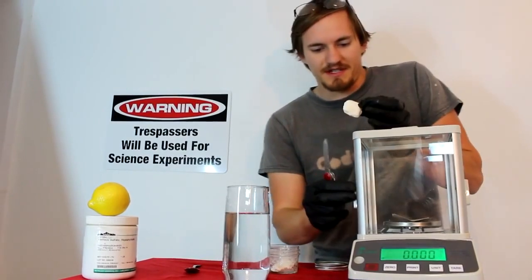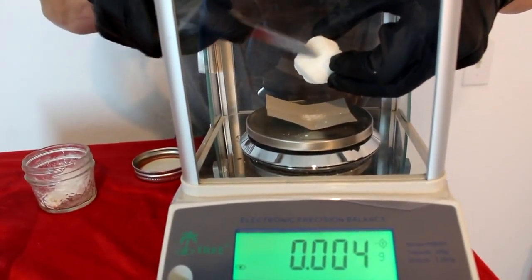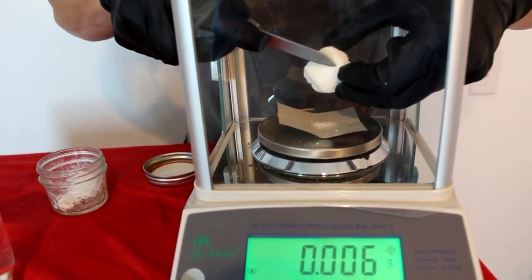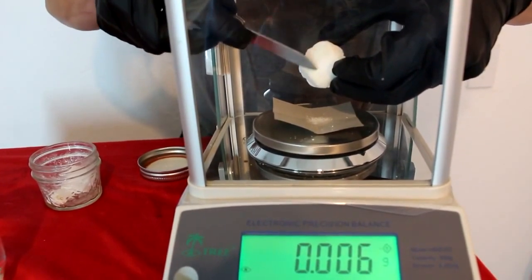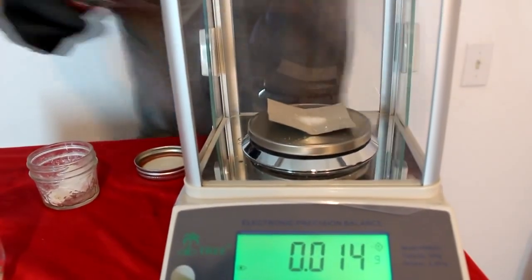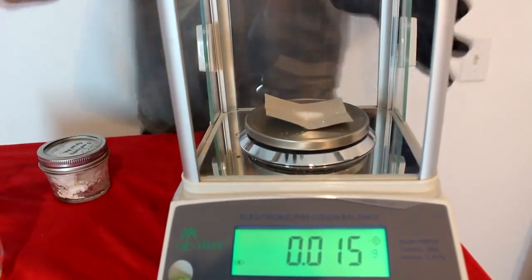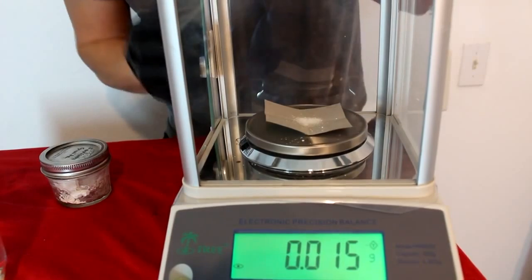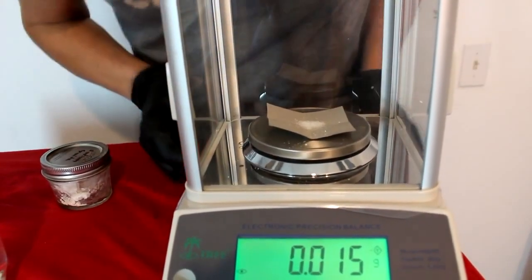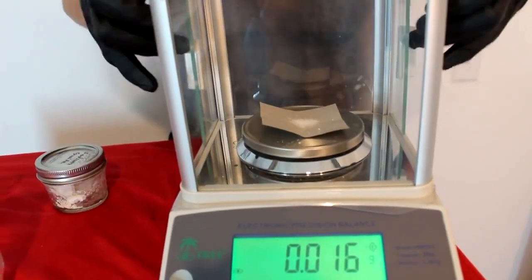If I bring this over to the scale, I'm going to shave off a little bit of the substance that was also used by the Nazis during World War II to kill people in their concentration camps — because cyanide is very cheap but also a very effective poison. Now I've got about 15 milligrams of that stuff. Let's close the shields on our scale and make sure that number is right. We went up to 16 — that's absolutely fine.